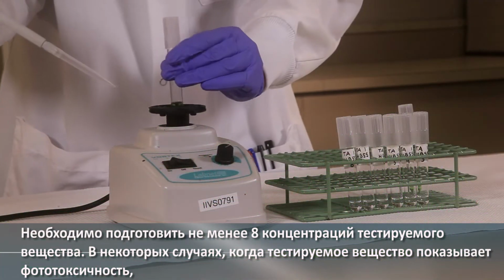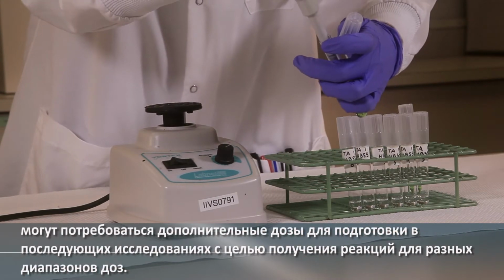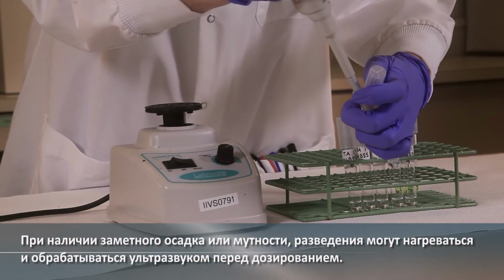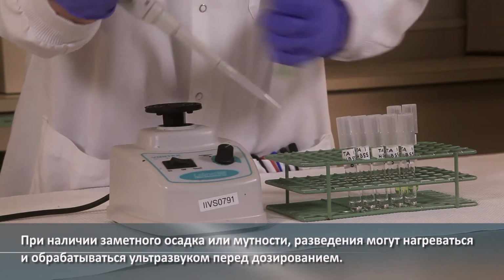In some cases where the test article shows phototoxicity, additional doses may need to be prepared in subsequent trials to address the range of dose responses. If there is any noticeable precipitation or cloudiness, the dilutions may be heated and sonicated prior to dosing.